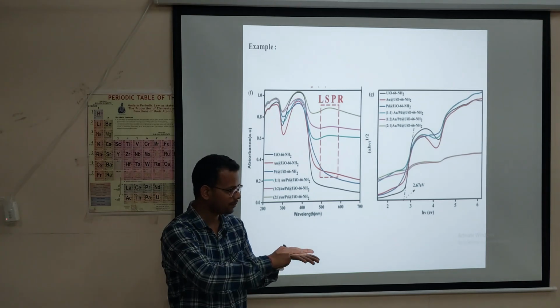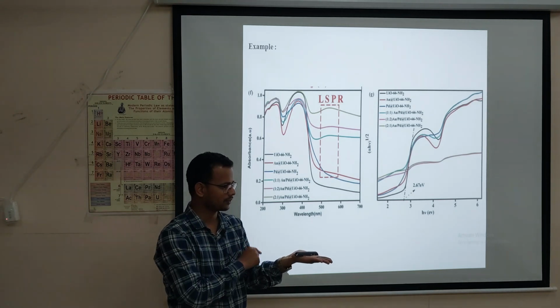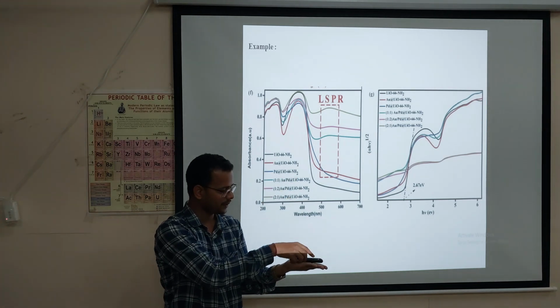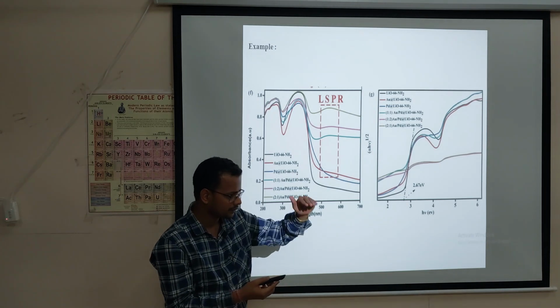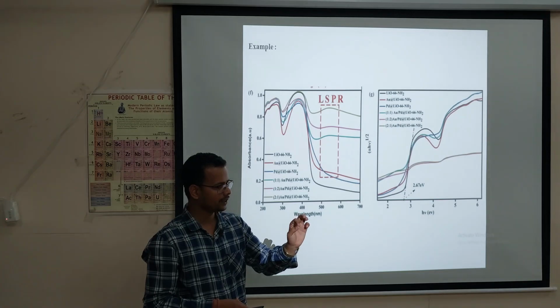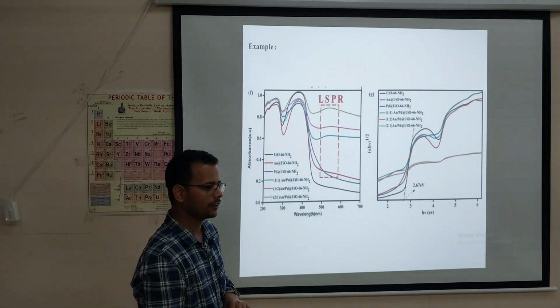Now the surface of the material, suppose this is a surface, and I add this one. The graph I got previously, I will not get the same graph here. It might increase or might decrease. If it is arranged in a sequence, the peak height may increase. If it is arranged arbitrarily, we may get a less intense peak. If our arrangement is very sequential, we may get a high peak, or else we will get a less intense peak. Clear? Or any other doubt?